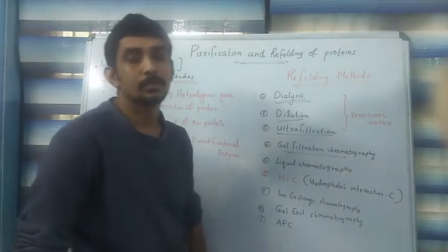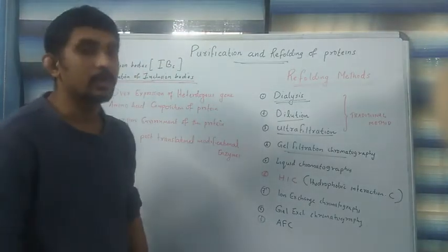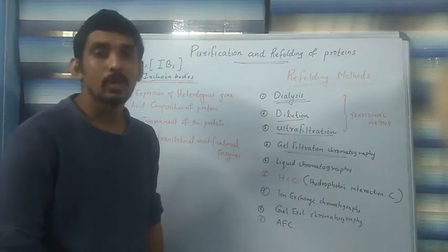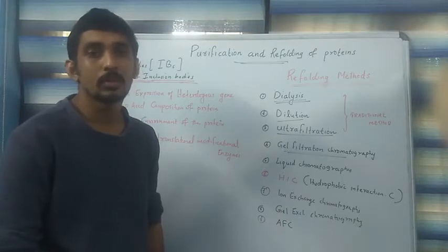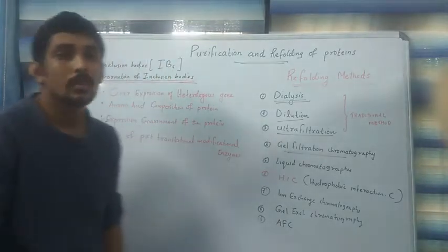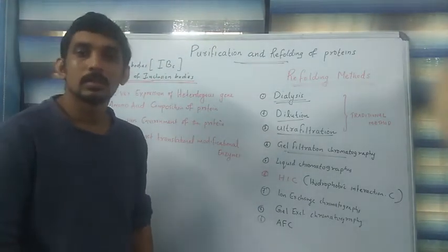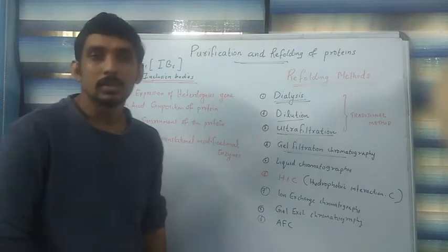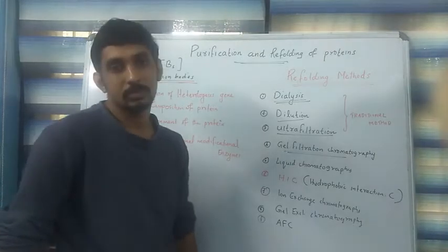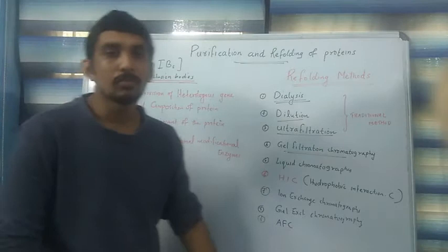In this video class, we are going to study mainly the topic purification and refolding of proteins. Especially, we are going to deal with recombinant protein. We already studied in biotechnology about heterologous gene expression, that is expression of a particular gene within a foreign cell.